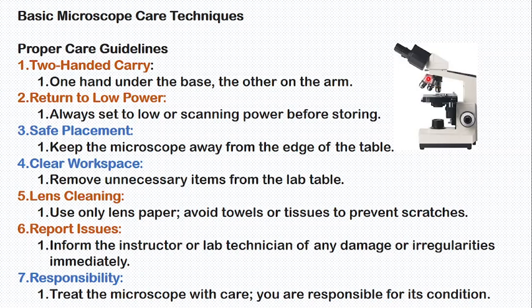I told you the microscope has many objective lenses, large and small. Remember, when you finish, put the small objective lens over the stage. Now another thing, safe placement. You should put it in a safe place and clear the workplace, meaning remove unnecessary items from the table. Once you put the microscope there, remember to remove other things.